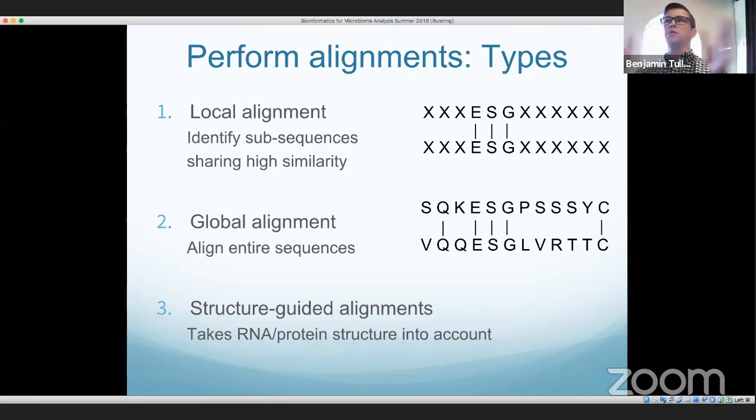They have that visually broken up so that you can actually see where the 2D structure is of your rRNA gene. If you're looking at the alignment and it looks like it's a little off, they have all these symbols that tell you if it correctly fits into a loop or it correctly fits into a stem, so you can make little adjustments based off of the structure of the rRNA to get a more accurate alignment.